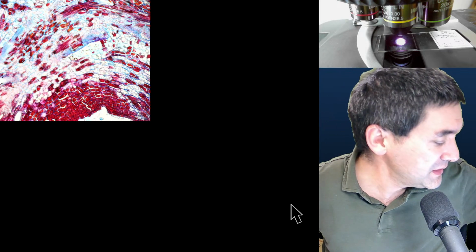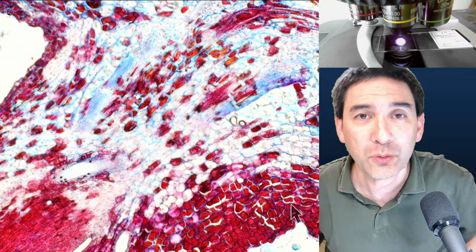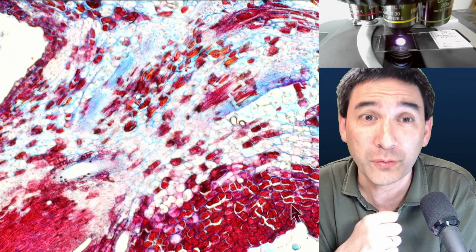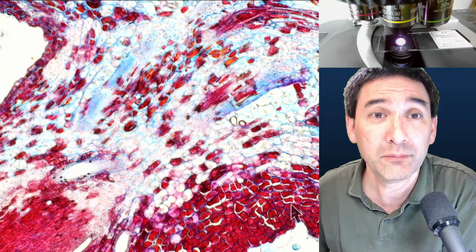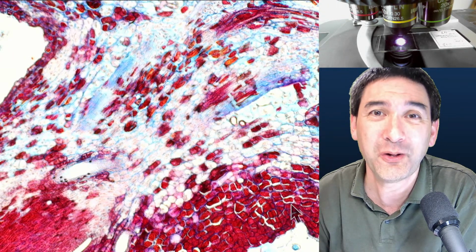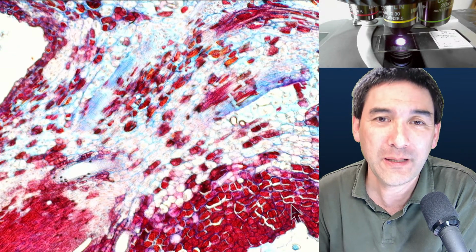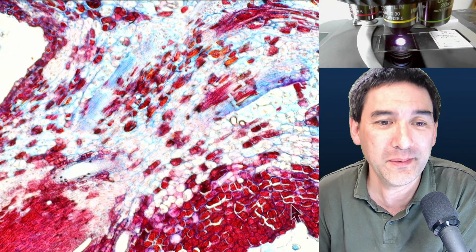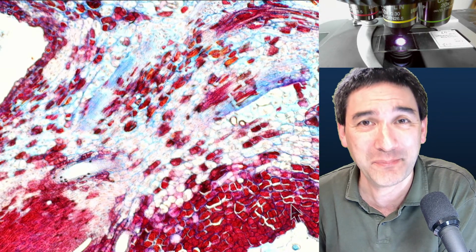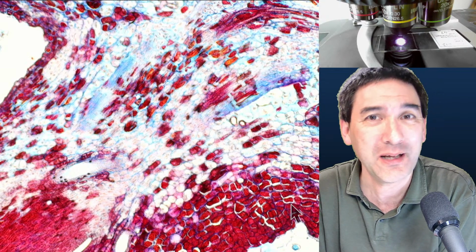So this is a thing that is a little bit difficult for me to do. Of course, I can add scale bars. This would also work, and then you'd have a scale bar going from one place to another, and it says 10 micrometers. Right? But how much is that? So it's also not always very useful. And for this reason, I have not yet found a satisfying solution concerning the magnification issues.